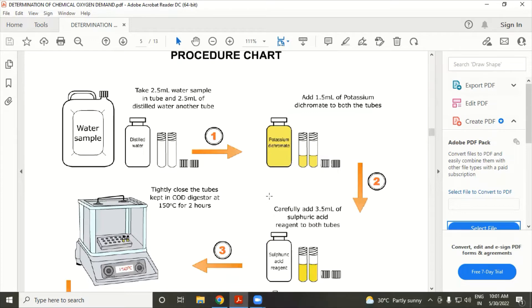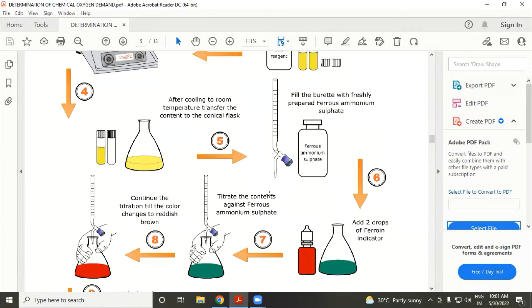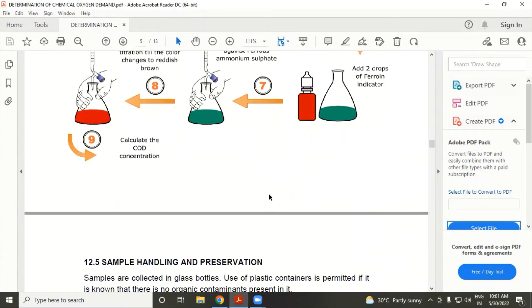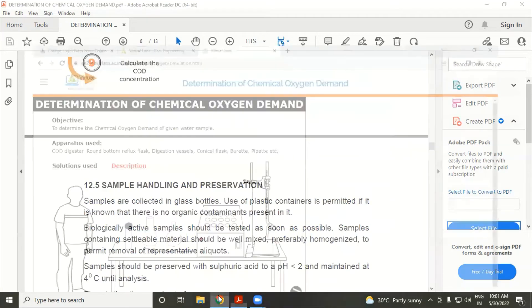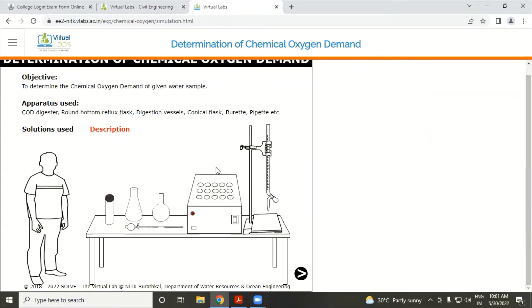This is the procedure. Our aim is to determine the chemical oxygen demand of a given water sample. The apparatus required includes a COD digester, digestion vessel, conical flask, burette, pipette, etc.